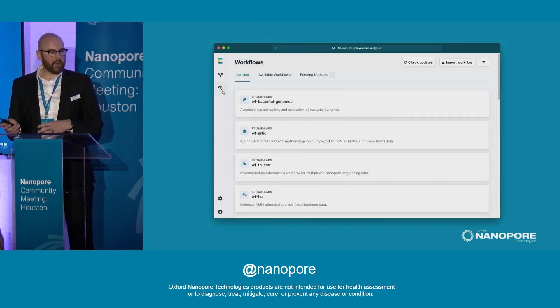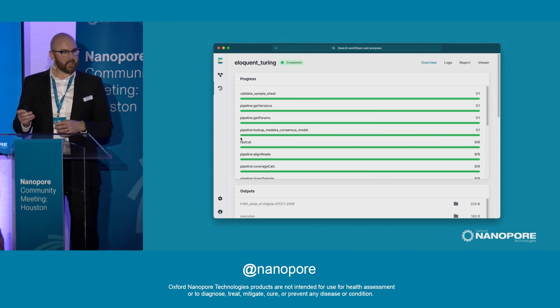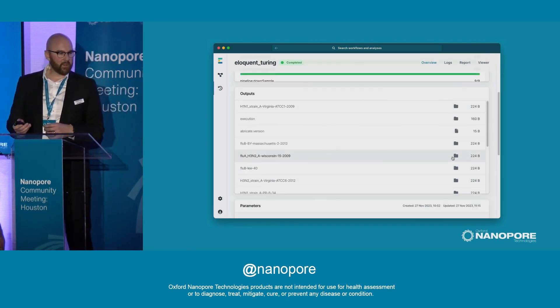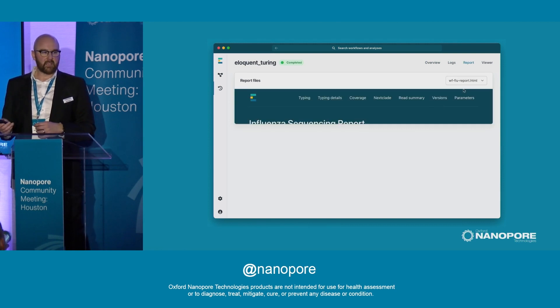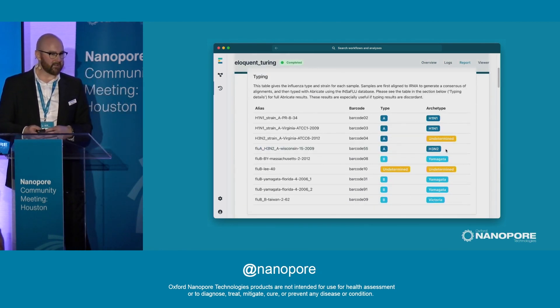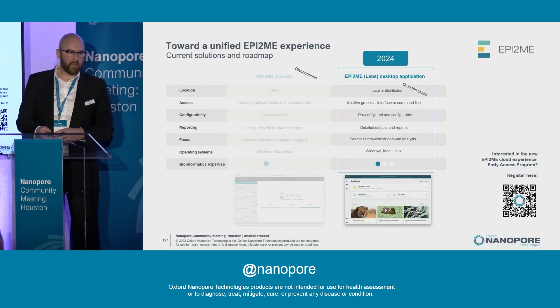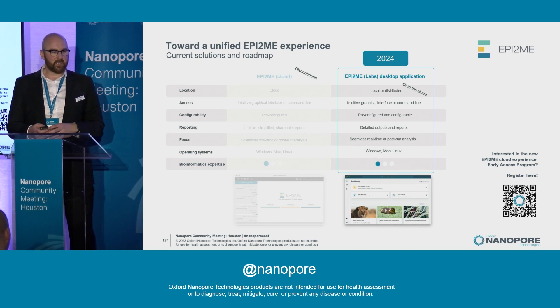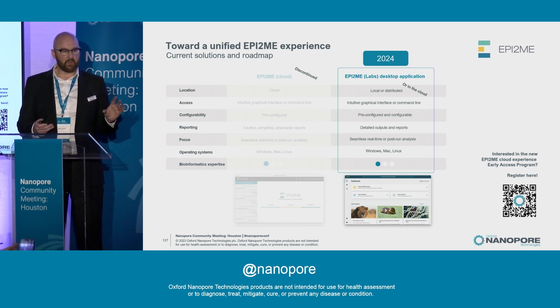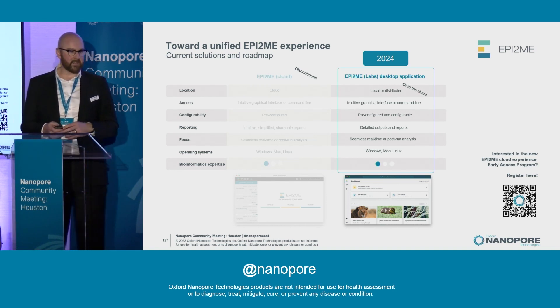I've pre-prepared some data from our flu workflow. This workflow completed successfully — here are the outputs available. You can see the sequencing report, which gives you the type of flu detected. We're working towards a unified Epitome experience, and by early 2024 we want Epitome Labs — which was the old name — to become Epitome. This is going to execute workflows in the cloud and locally on your devices.